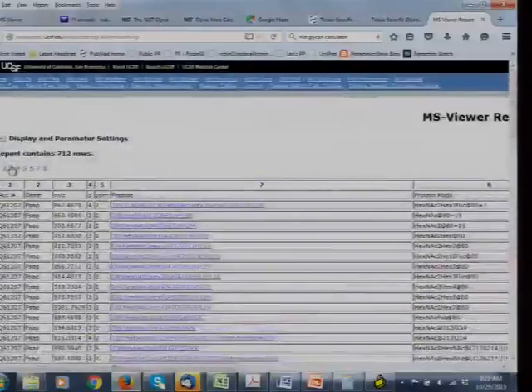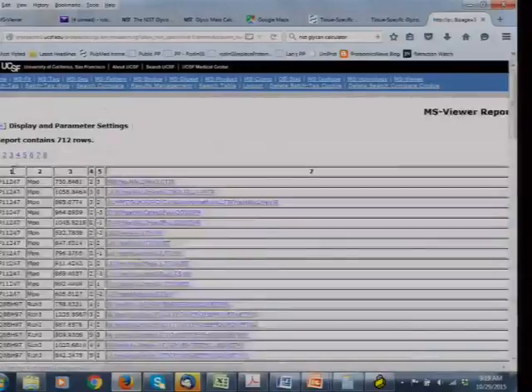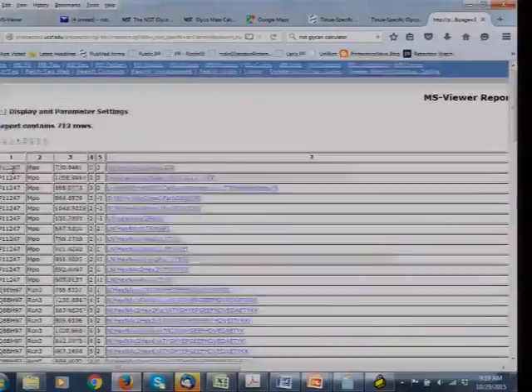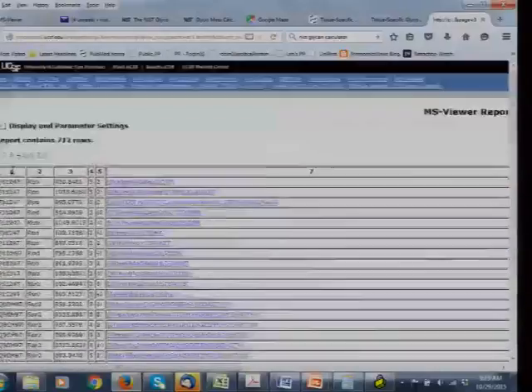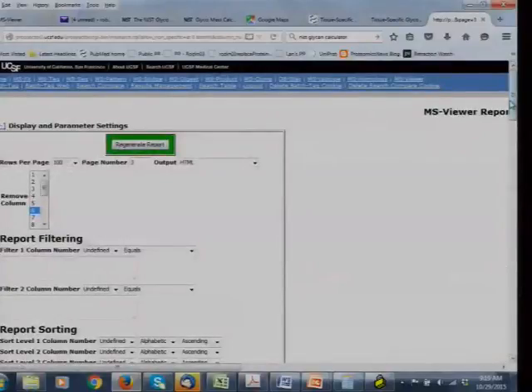Somewhere in this report is going to be the example we were just going through. It's going to be tricky to find. Oh, actually, it isn't tricky to find. Tell it what we're looking for.